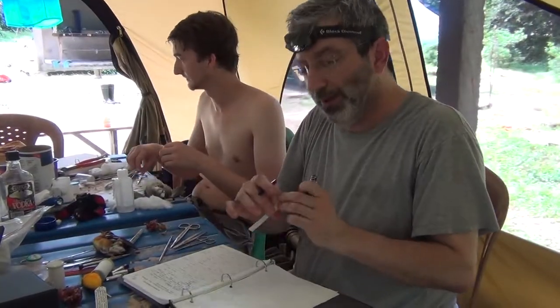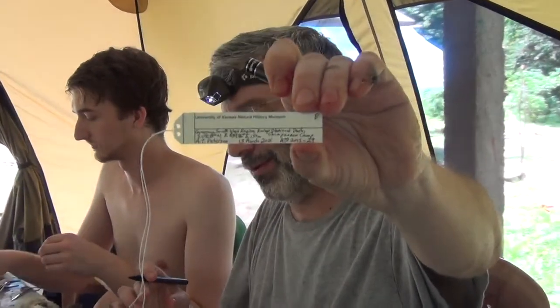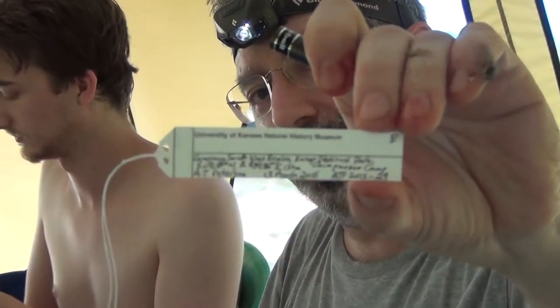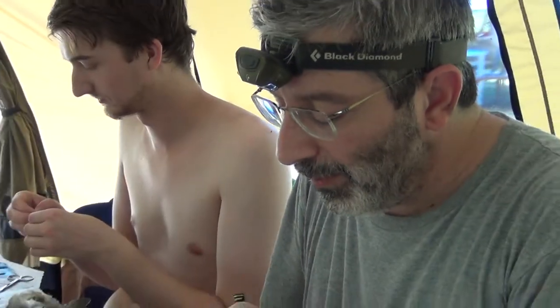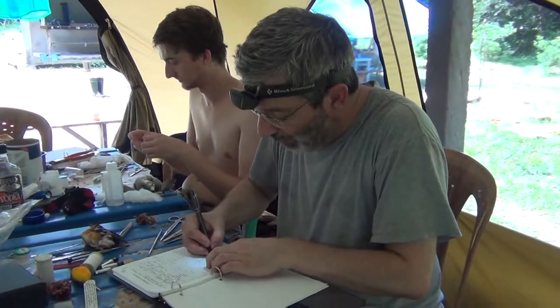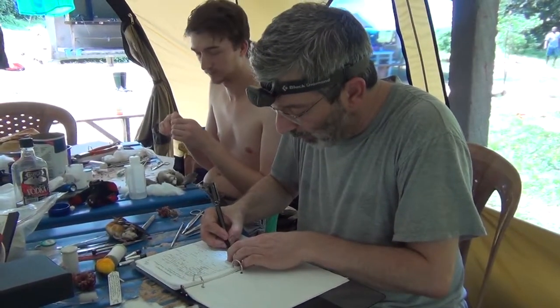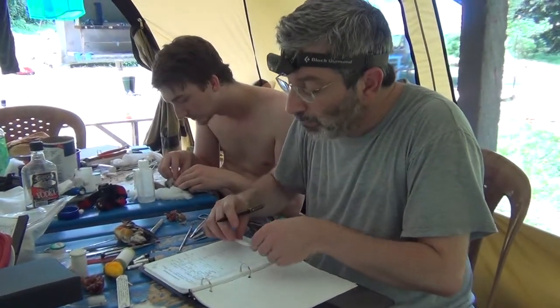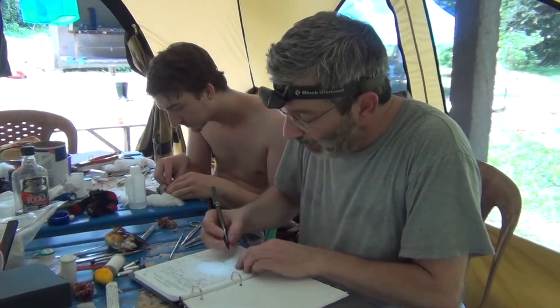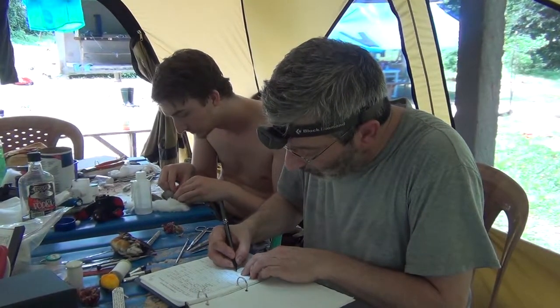One side of the tag has all the locality information — date, place. The other side of the tag has all the rest of the information: the tissue number to connect to our tissue catalog, and all of this information about condition and habitat and things like that.